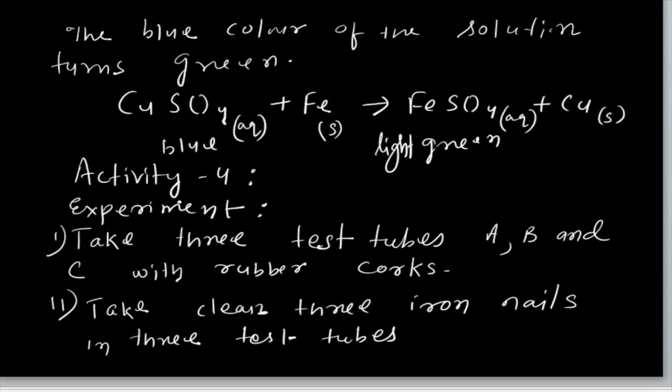Are you clear? I think so. What is a displacement reaction? When iron is more reactive than copper, then only iron can displace copper and change to ferrous sulfate. Then Activity 4. Now take test tubes A, B, C with rubber cork.